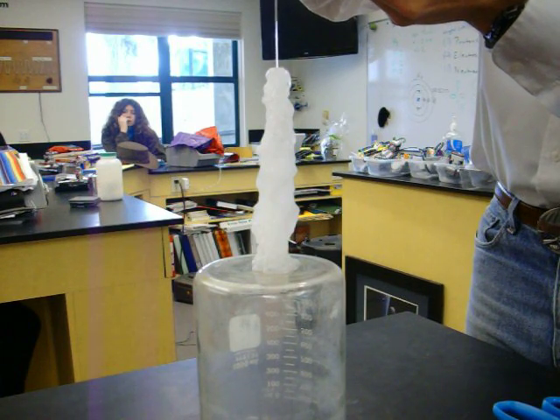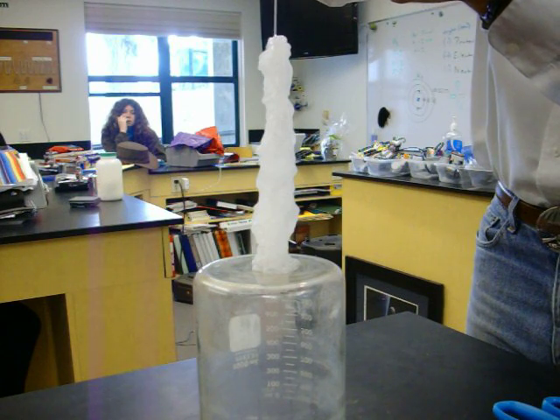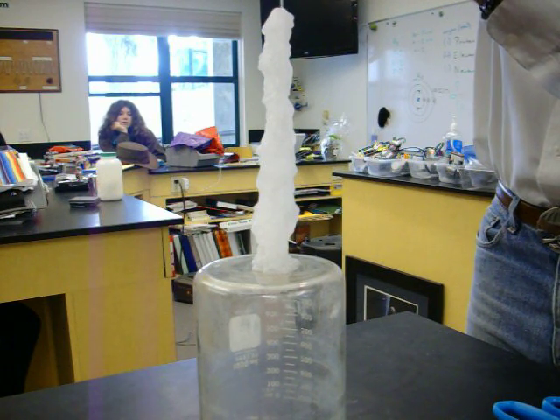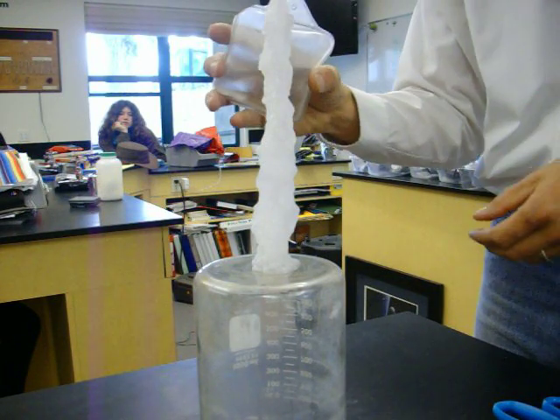Isn't that amazing? It's almost too tall for the camera. Isn't that cool?